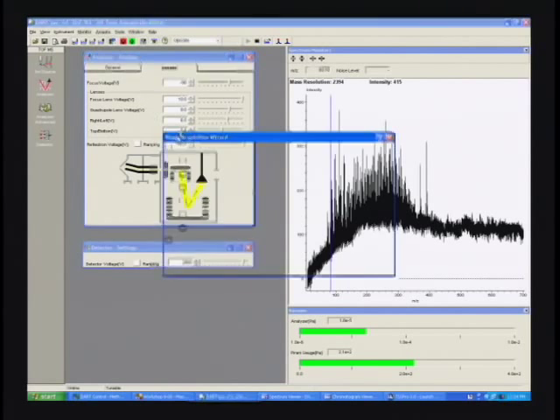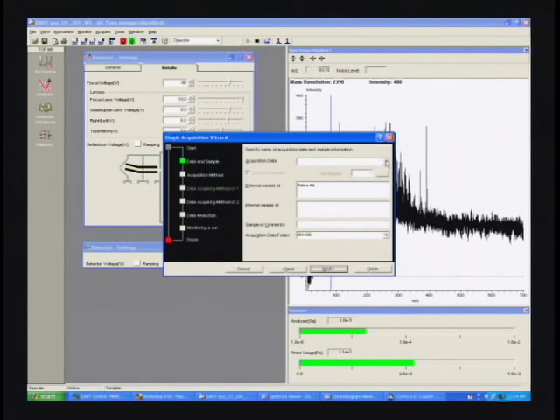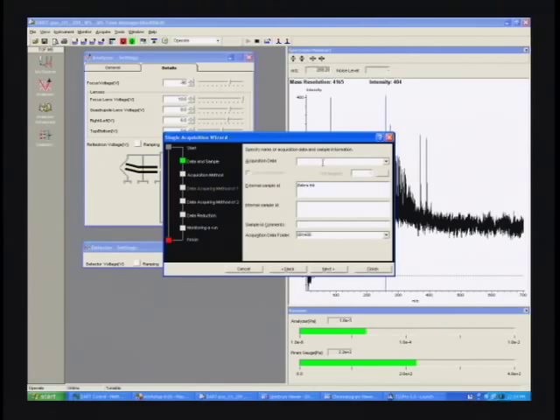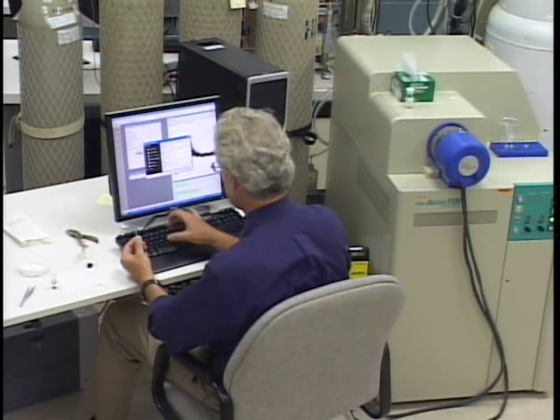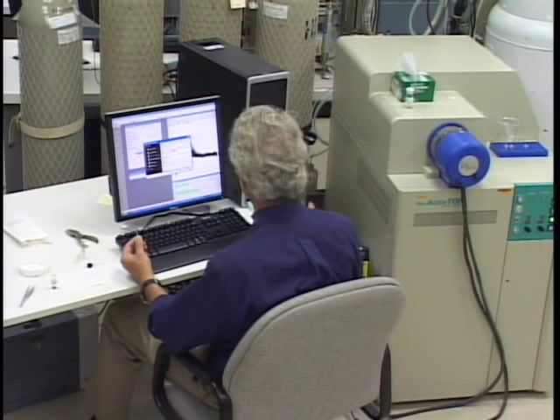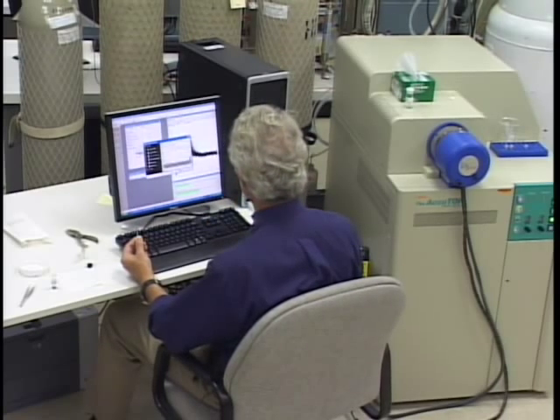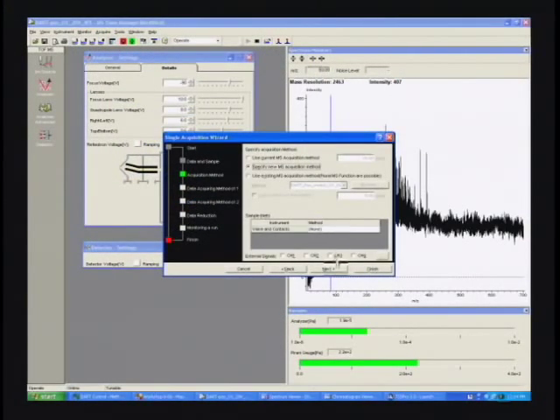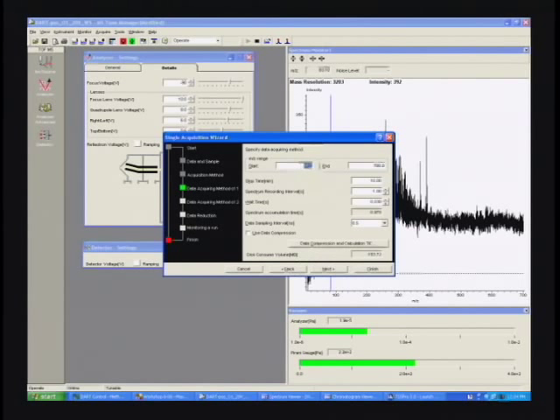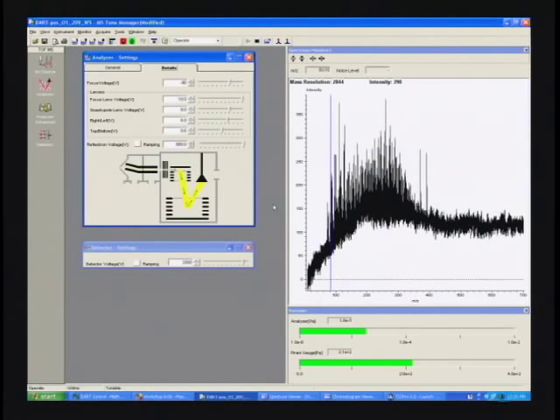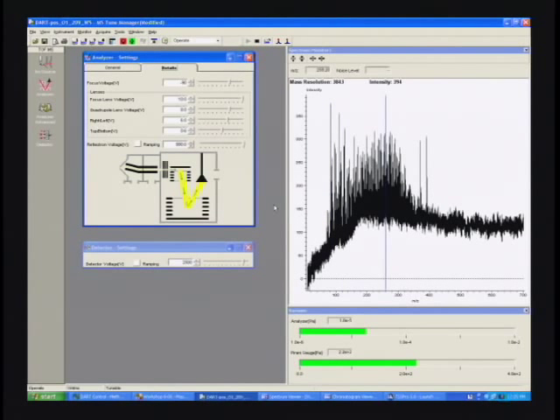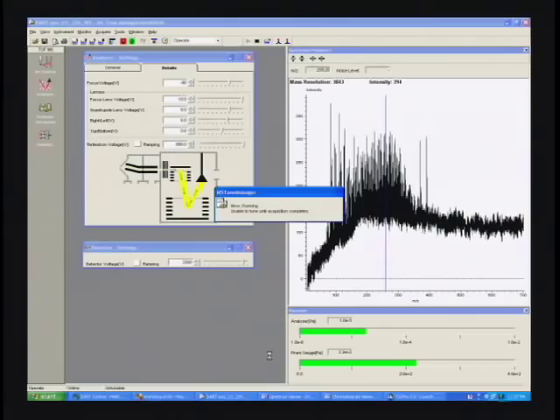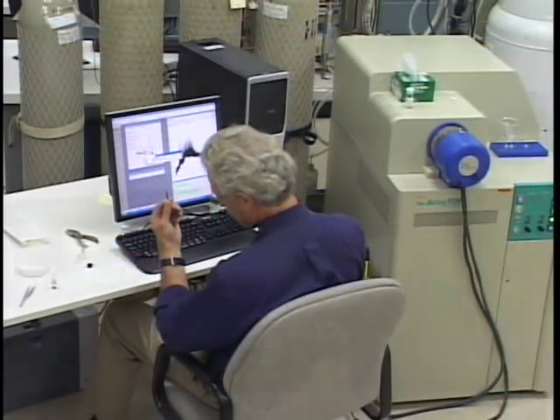We'll go ahead and open up a data file and let's give it a file name. The hard part is grabbing the gunpowder particle. Let's go ahead and open the data file. As soon as that comes up, if we can keep a grip on the particle, we should see some peaks show up in the dart. It helps to have really fine forceps to grab these small particles.